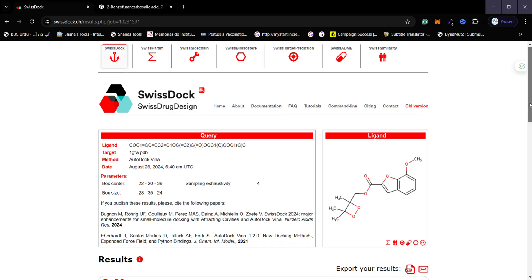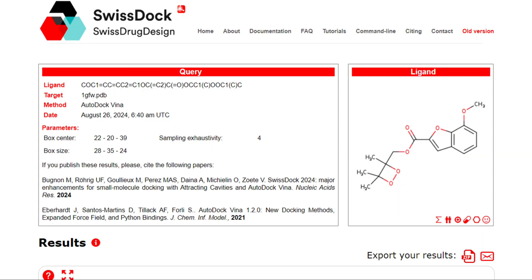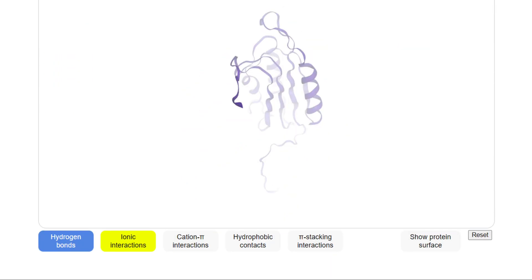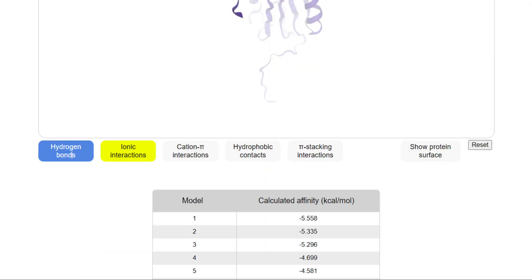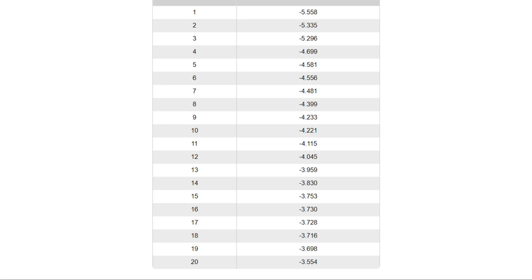Once the docking is completed on SwissDock AutoDock Vina, the results page will appear. On the top left side you can see your query, including the ligand SMILES, the name of your uploaded target protein, the method used, the date, and the parameters. You can also see references for the studies in which SwissDock AutoDock Vina is published. On the right side, you can see your ligand structure. Scrolling down shows the 3D protein structure and the affinity scores. SwissDock generates 20 different poses of the ligand and calculates their affinities with the receptor protein. The smaller the affinity value, the better the binding pose.